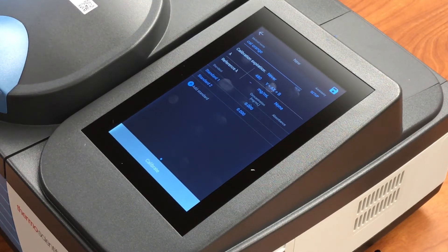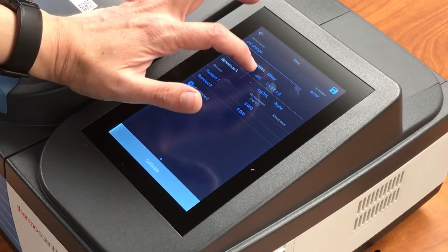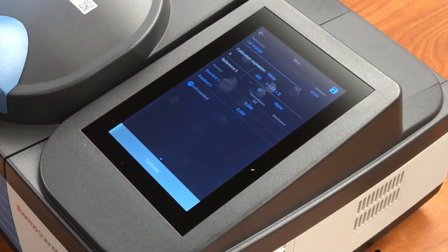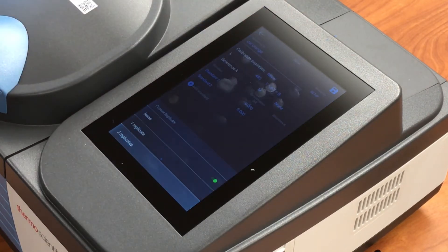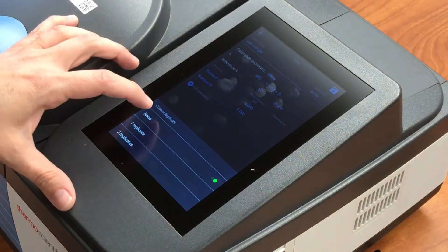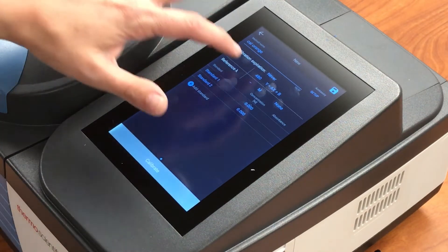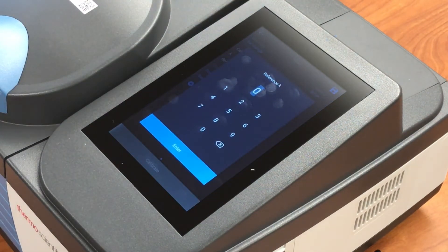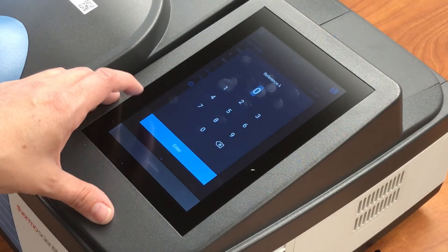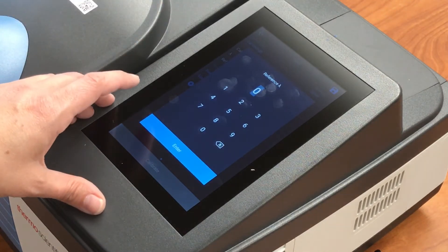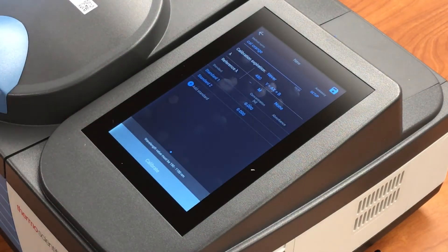Under the reference wavelength row, you can select the units that your standards are measured in. If your solutions are in molar, select that here. In the replicates setting, you could set up a number of replicates, but we don't need to do that for right now, so we're going to leave that at none. You could set a reference wavelength — if you know that at a particular wavelength the absorbance for the sample should be zero, you could put that in here, and that's another way of doing a background correction. We're not going to do that, so we're just going to leave that as zero.